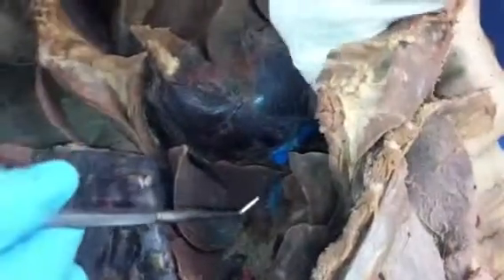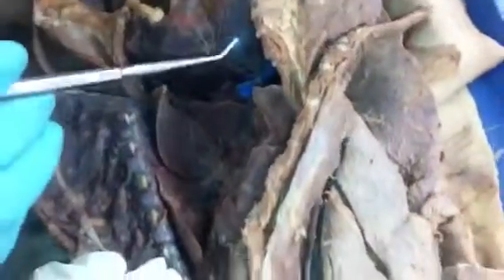So basically, the left anterior lobe. This is the right, left. Okay, so on the left side you have the anterior, middle, and posterior. And then on the right side you have the anterior, middle, and posterior. And then the mediastinal lobe is this thing in the center. This one. And then the oral pharynx. No, the mesenteries. This one.